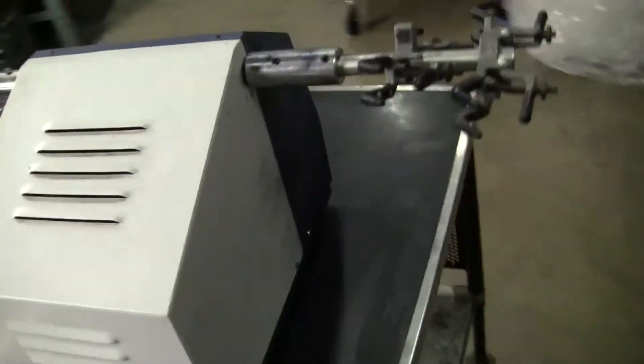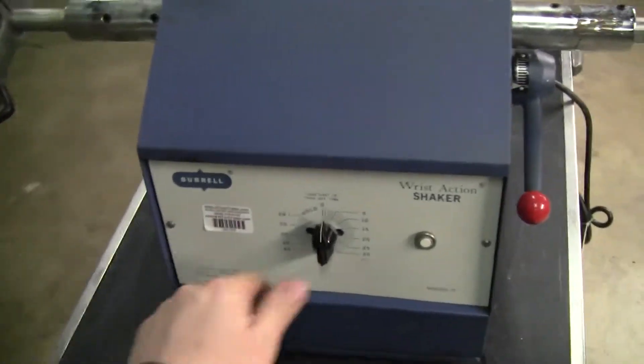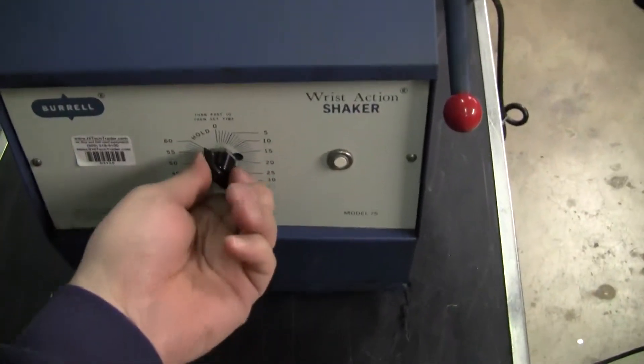115 volts. Clamps are always adjustable. We have a hold position on, which is going to turn the unit on constantly. And then we have the timer function.